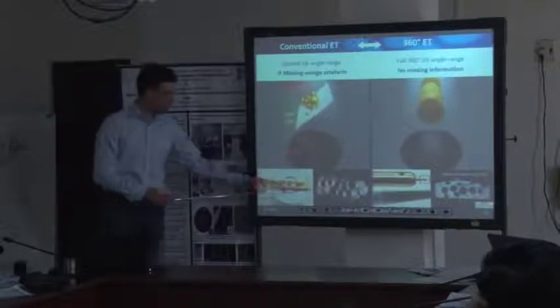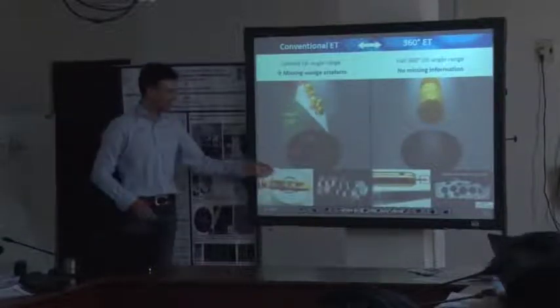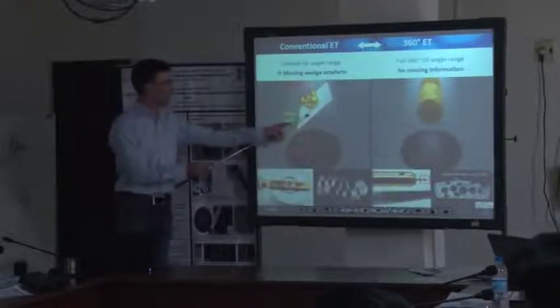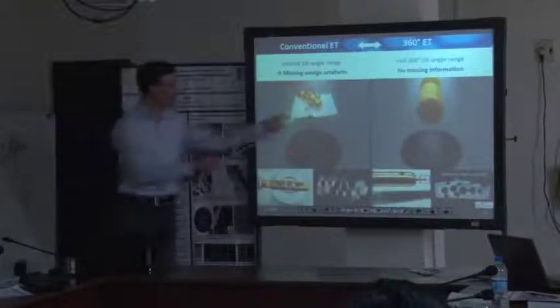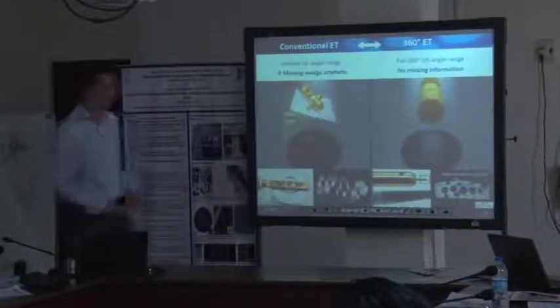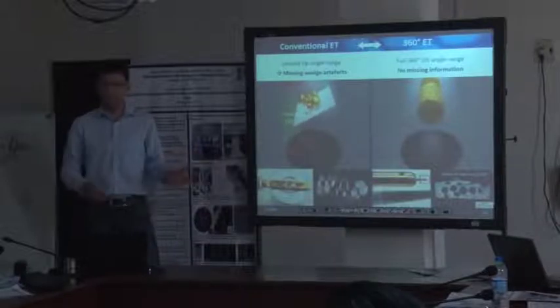But with this, you can easily imagine that we are somehow limited in our tilt angle range, because we cannot tilt to 90 degrees, since with such a sample, the sample would just shadow itself. Okay? Meaning that we have a so-called missing wedge, and this missing wedge causes artifacts, because in that angular range, we don't detect any information about our sample. So during the reconstruction, we cannot say anything about the sample in this particular direction.